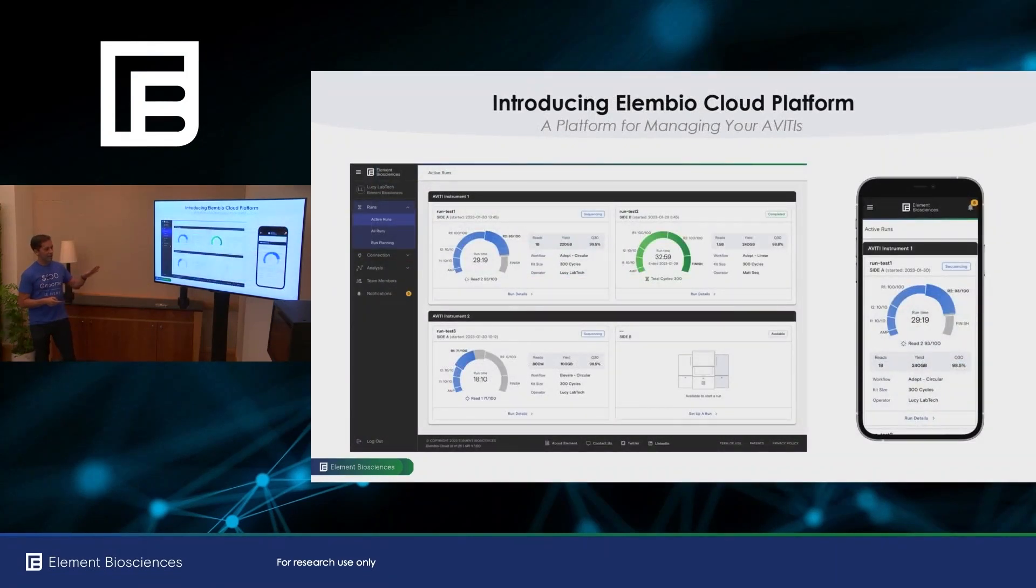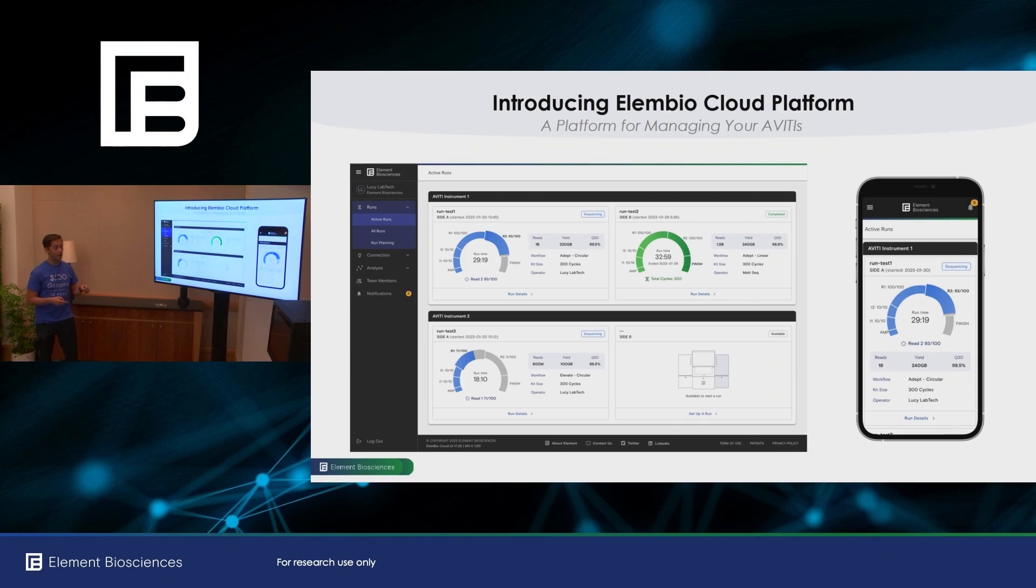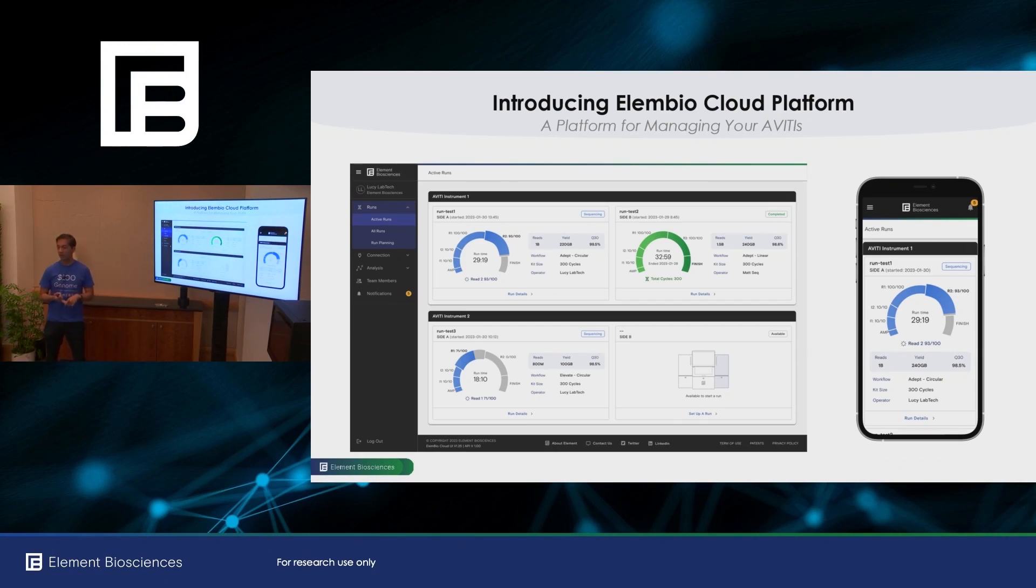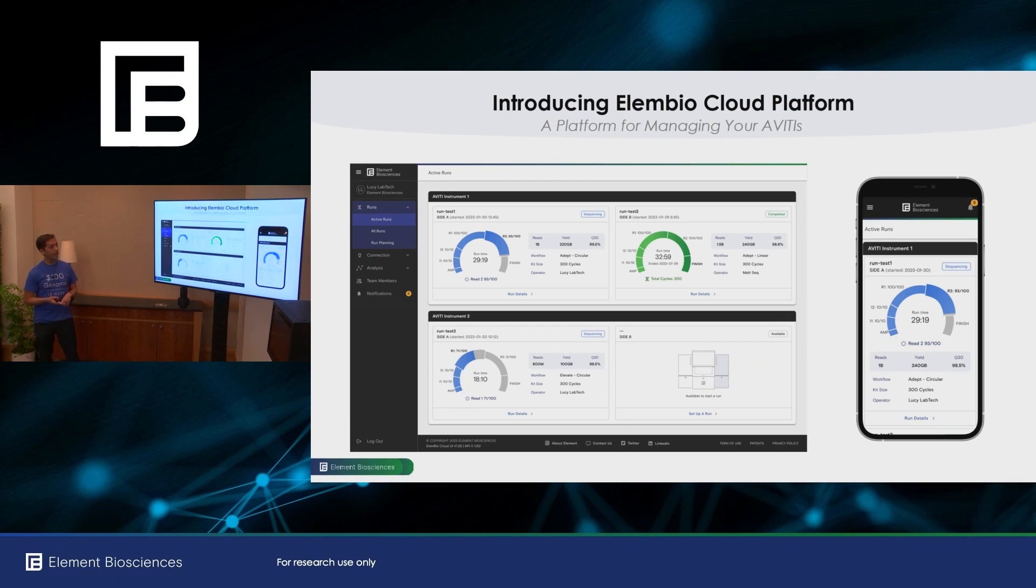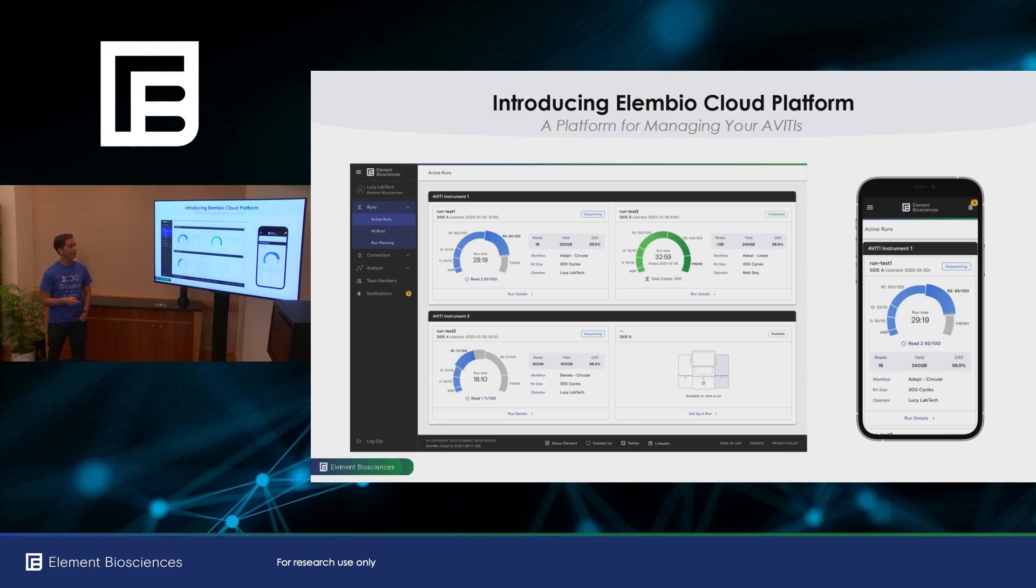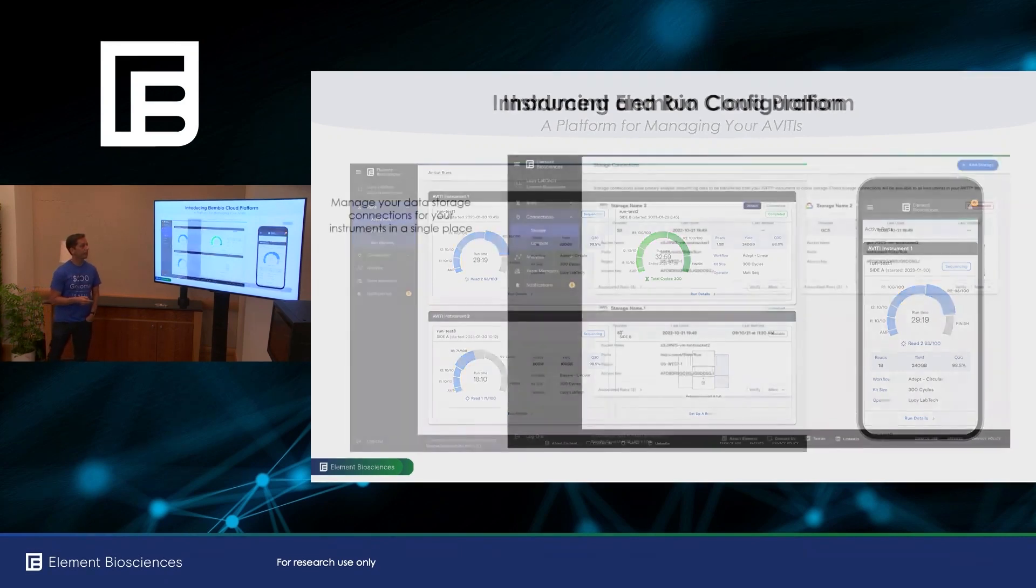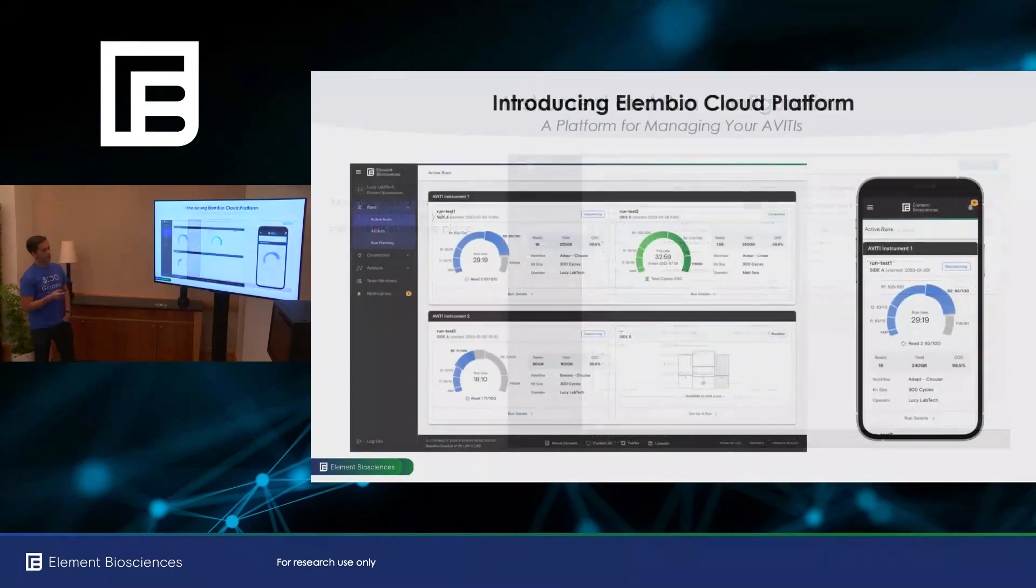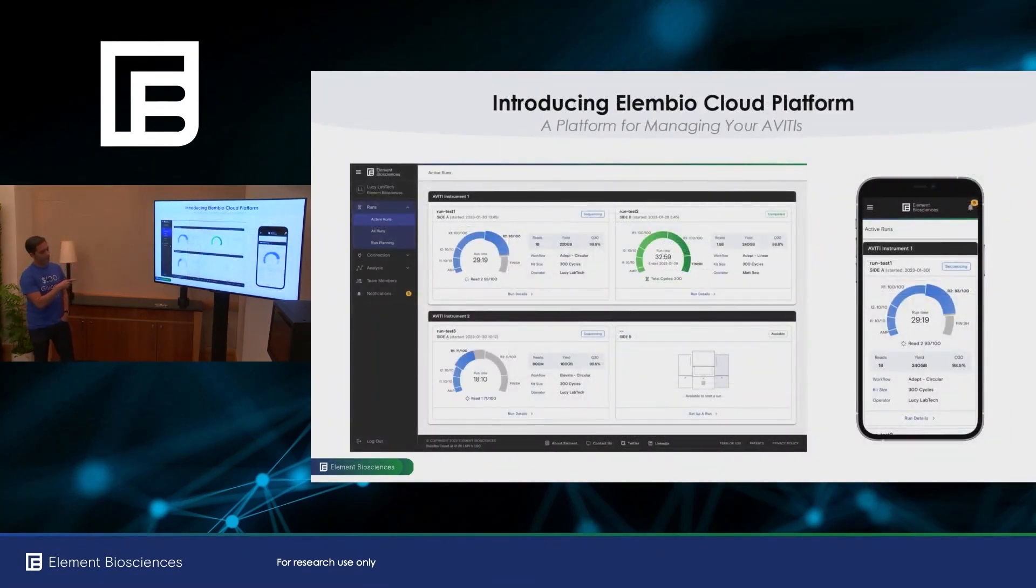So today I'm happy to be introducing you to the Elembio Cloud platform, which is a centralized portal for our customers to interact with our Avitis. You can do instrument configuration, user management, run configuration, run monitoring, and also manage analysis flows, which I'll be talking about. And it's optimized for both desktop and mobile use.